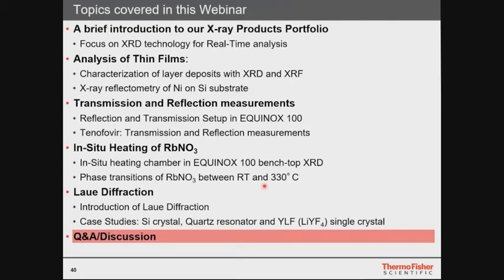So the signal to noise ratio, in this case, is 10. This is known as the counting statistics of your scan. Usually you have to choose a measurement time which yields the signal to noise ratio which you need to solve your problem. And by increasing the measurement time, you can also get a better signal to noise ratio.